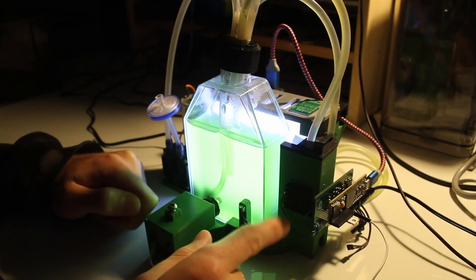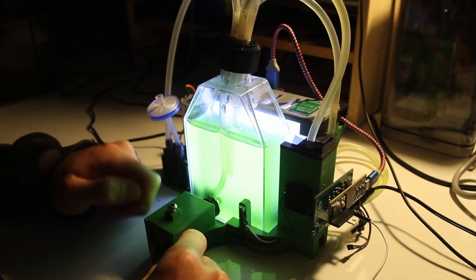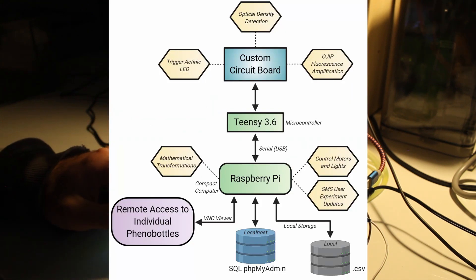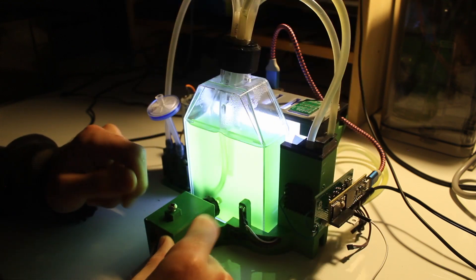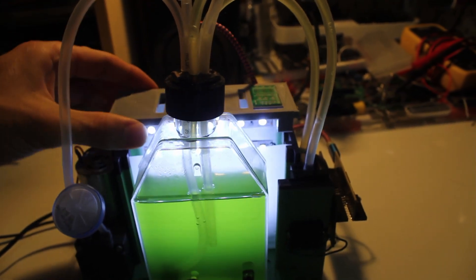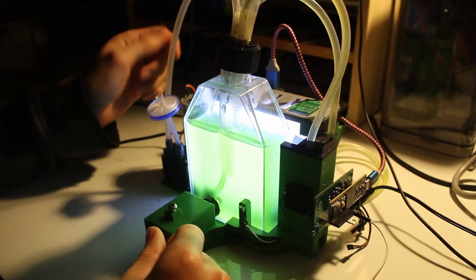All the information is then sent back to the Raspberry Pi, which allows it to be sent to a database or to a CSV file on the computer. The Raspberry Pi also has controls over a few motors and the light intensity for the growth lights at the back here.